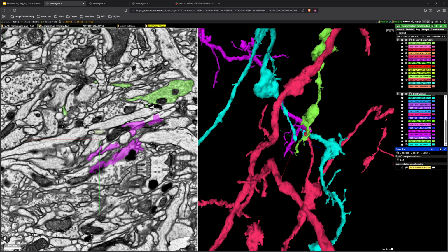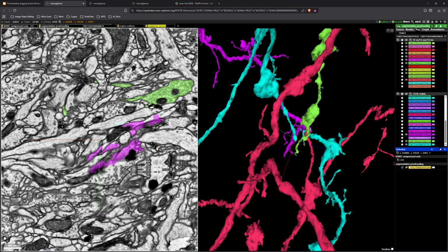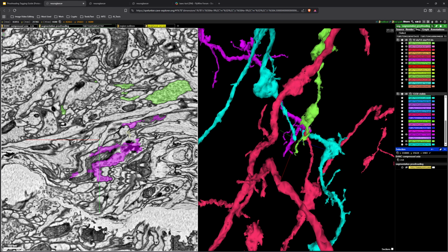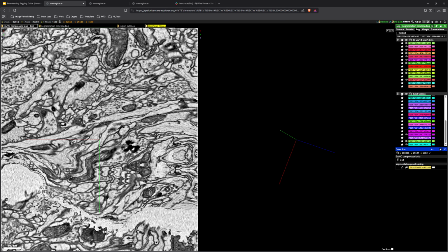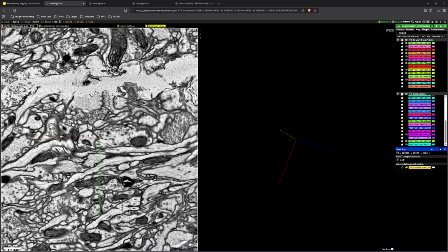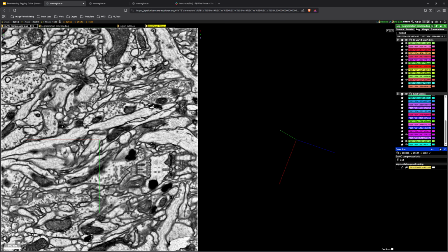This is a long, flatter piece. There's a long perpendicular or parallel plane cut axon. So we're following this. We got this guy sort of jutting upwards as well. So here, I believe, is the piece. If we turn off the alpha, it might help. So here's another helpful mitochondria we can keep our eye on. There it is, right up against the longer piece, which is touching that smaller piece.